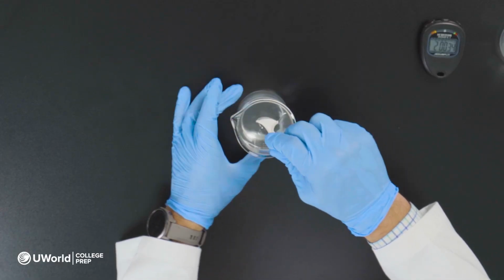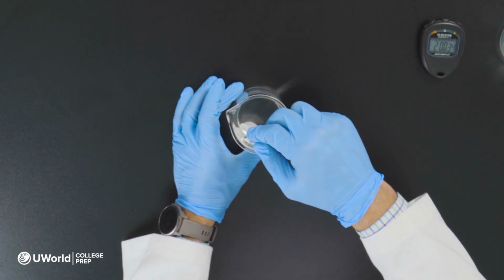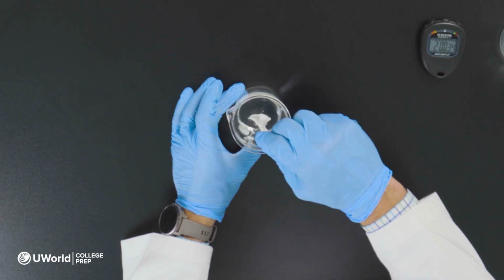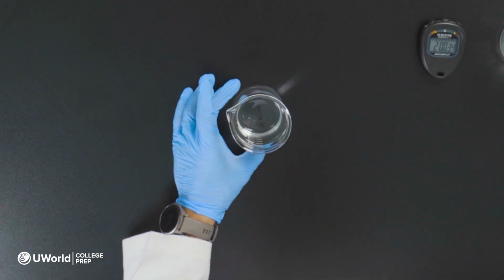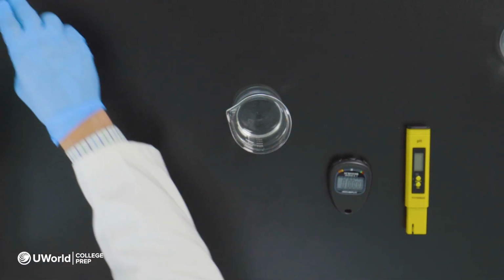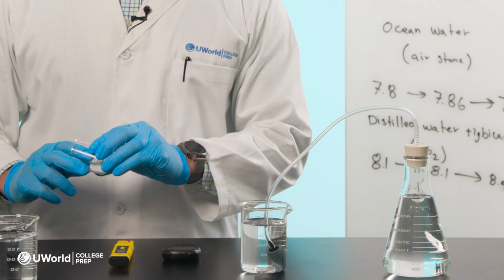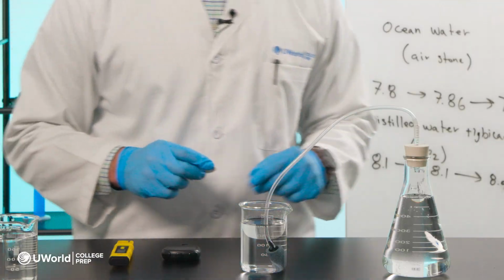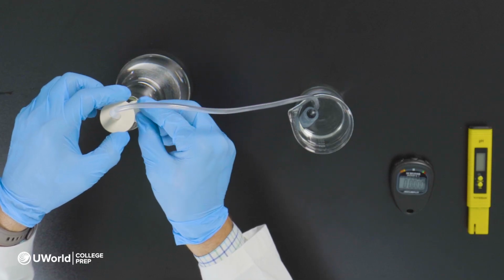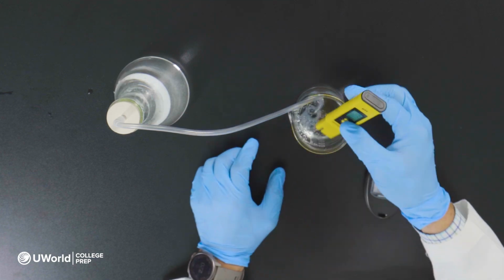It's interesting because the salt water looks a little bit cloudy because it already has so much salt dissolved in it. So it makes dissolving that sodium bicarbonate a little bit harder. So now that it's nice and dissolved, we get all our equipment ready. We set up our apparatus. So once everything is ready, we'll add our effervescent tablet. We'll hit start and start measuring.